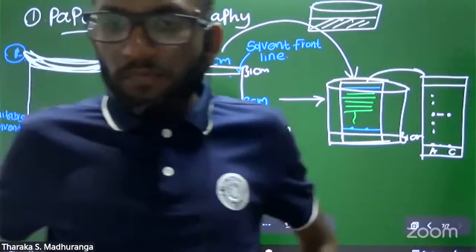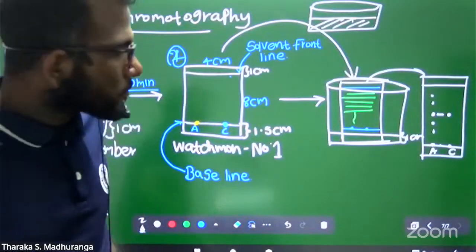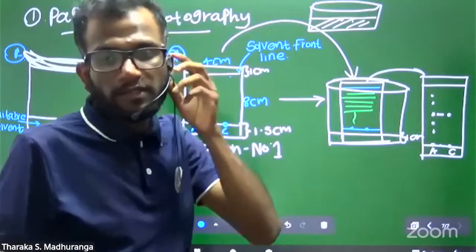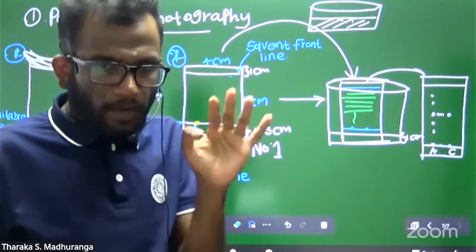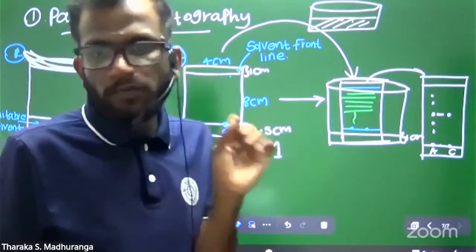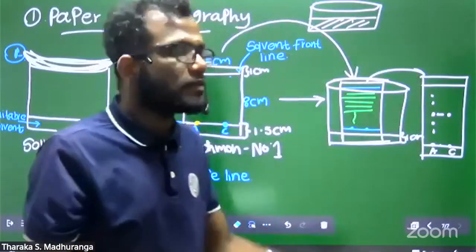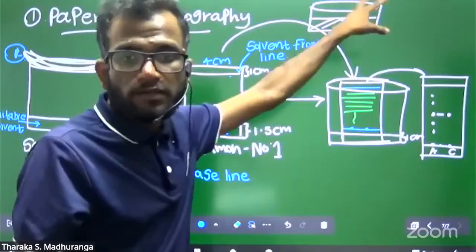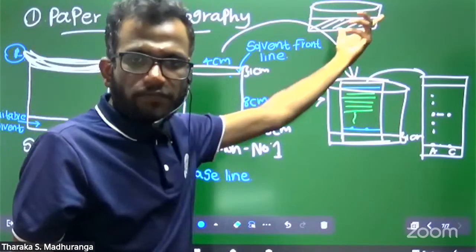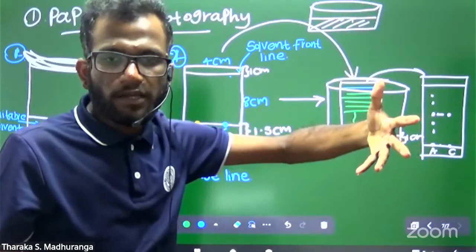Are A and C from the same extract or different? No, no. The A is the crude product sample that you need to identify. The C is the control, purified sample. Think, for example, this is a crude product separated from cinnamon leaves. I want to confirm whether this crude product has cinnamaldehyde or not.